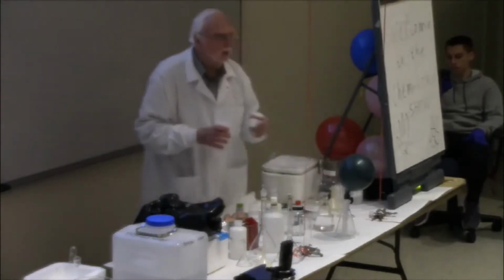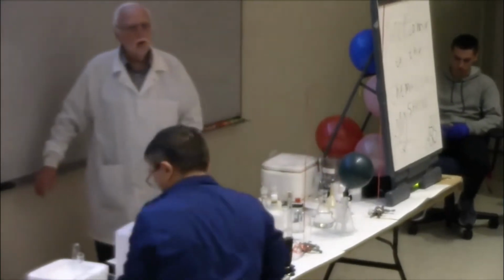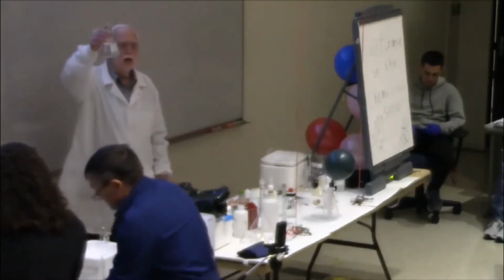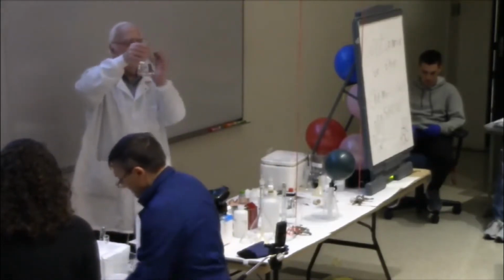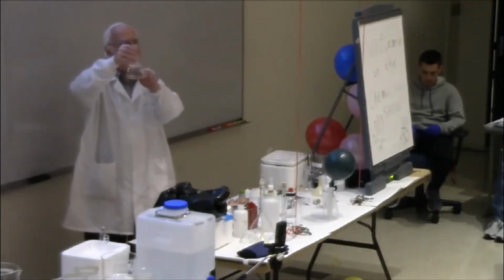Now what I want to try and convince you of is that when carbon dioxide reacts with water, the water becomes more acidic, because carbon dioxide and water gives carbonic acid. But the problem is you're not going to be able to see that by looking at it. It doesn't change color. So how are we going to convince you that when you add carbon dioxide to water, it becomes more acidic? I put a little base in there so you'll see the color change.